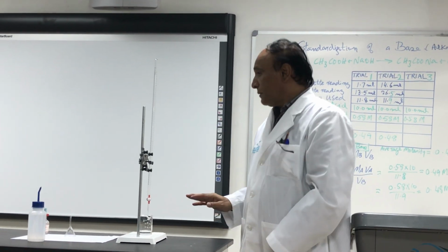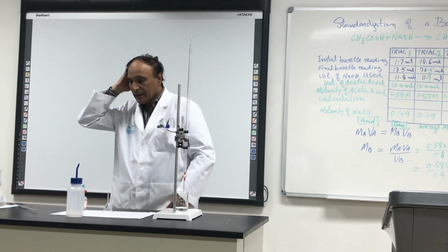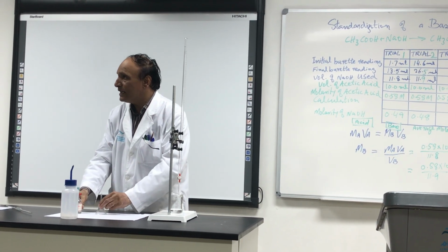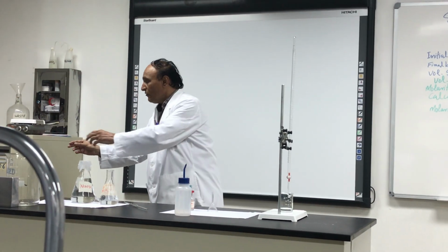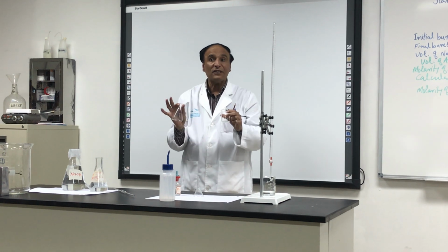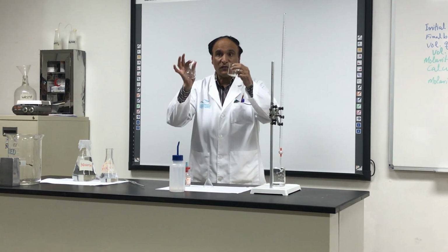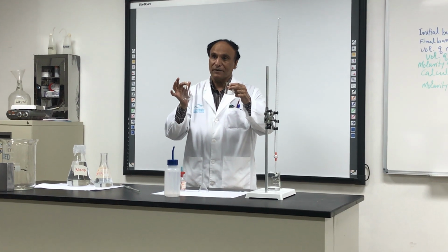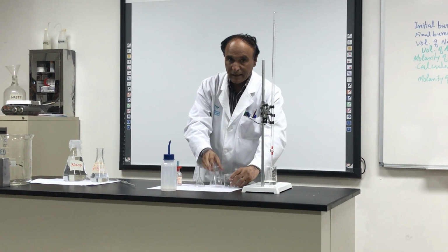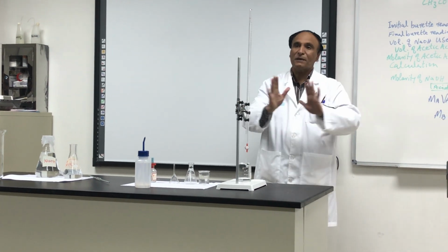So your things, please give me those items, and make your things clean and ready for the others. These are washed. Don't wash with the distilled water, as you know. Who will wash with the distilled water? The next. So put it over here, like these things are here. And all the experiment is complete.